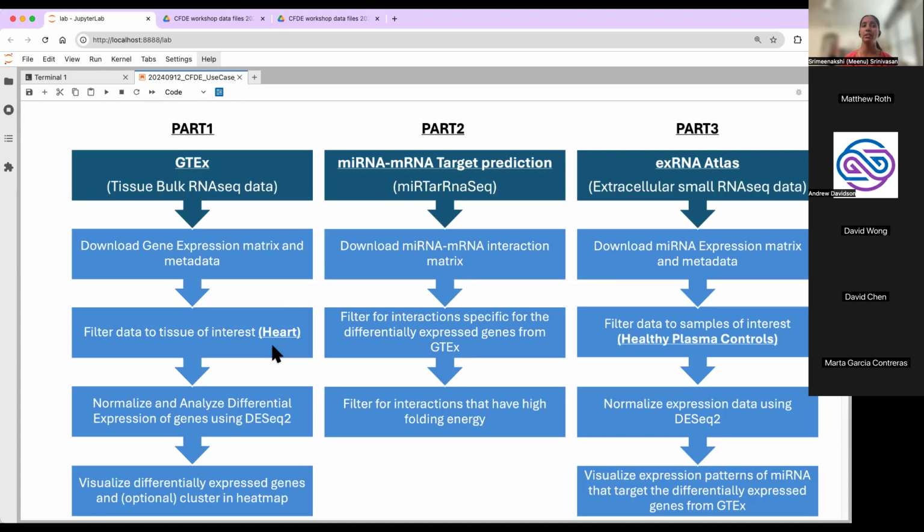During the filtering, we also removed genes that were very lowly expressed and kept only genes that were expressed at a count of 10 or more in 60% of either the female samples or the male samples. Then we normalized the data and ran DESeq2 to do a differential expression of the genes we are specifically looking for, in this case male or female.